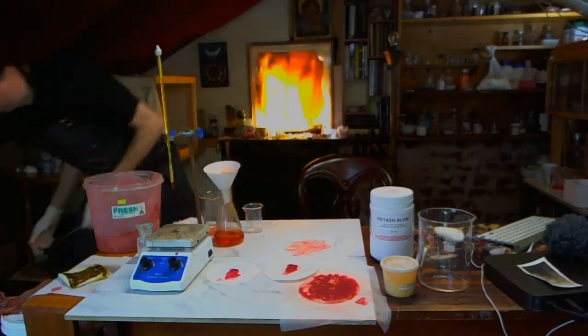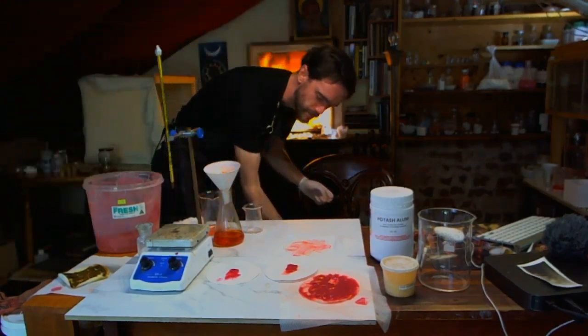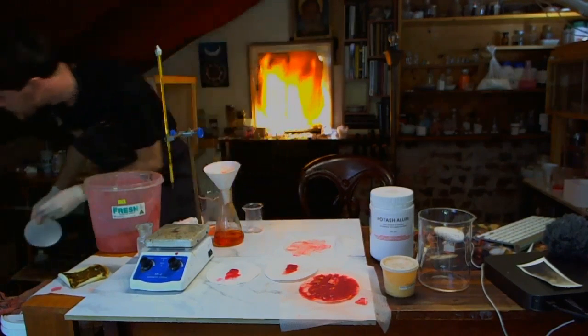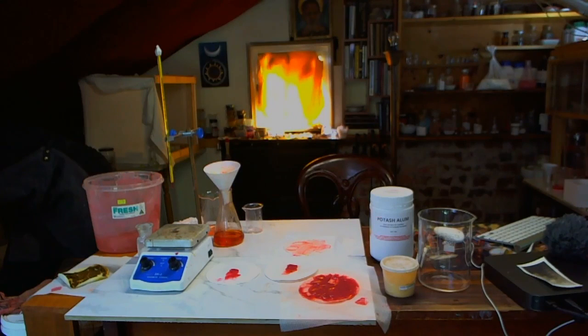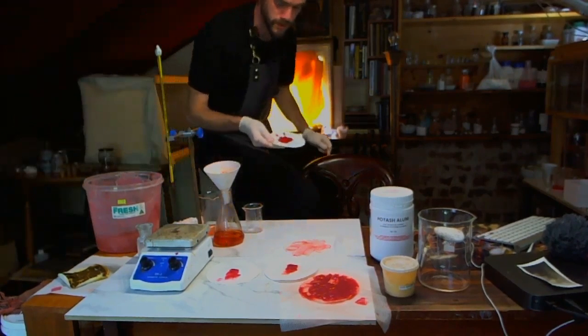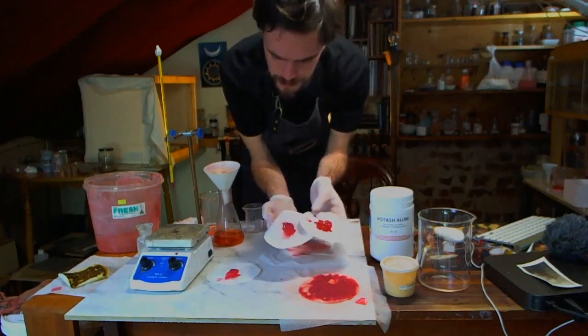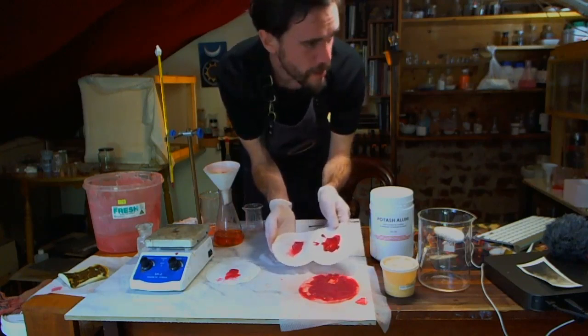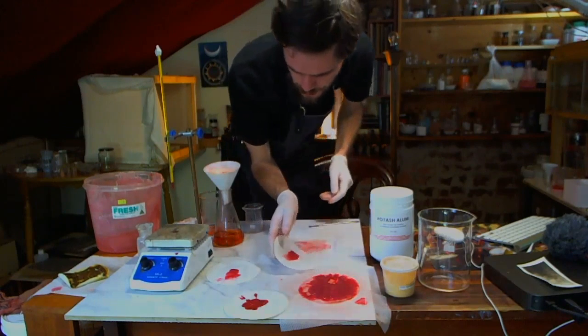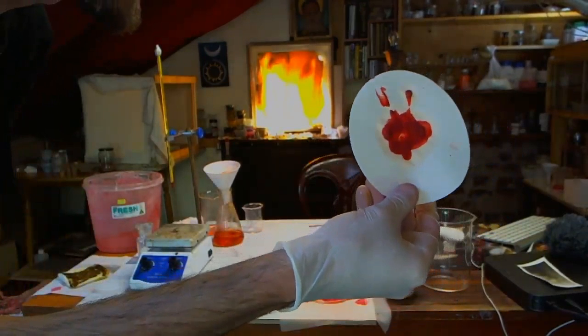Let's check on our original. Okay, and this is our first batch here, which is also quite nice. Quite vibrant and red. I'll come in closer with that too. So this is what we precipitated out yesterday.